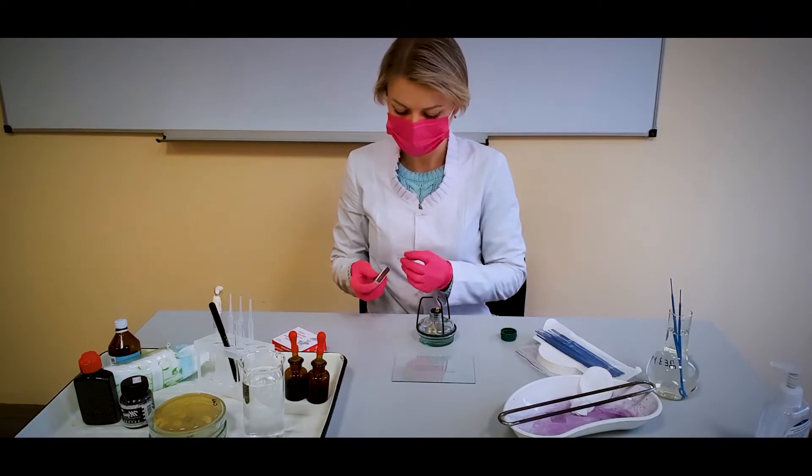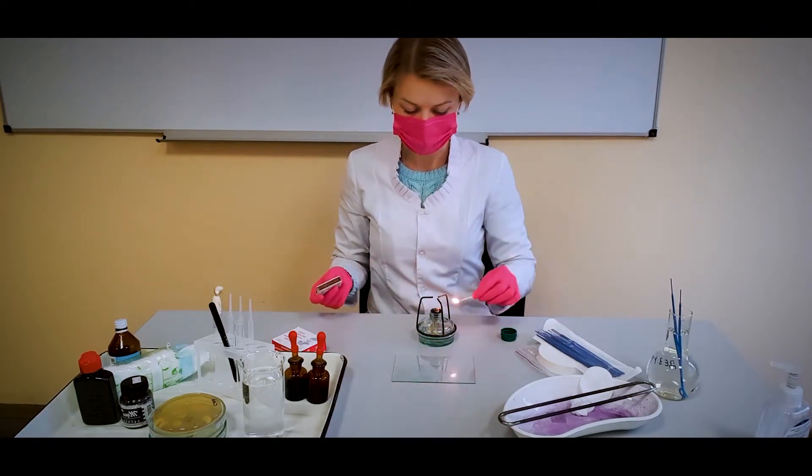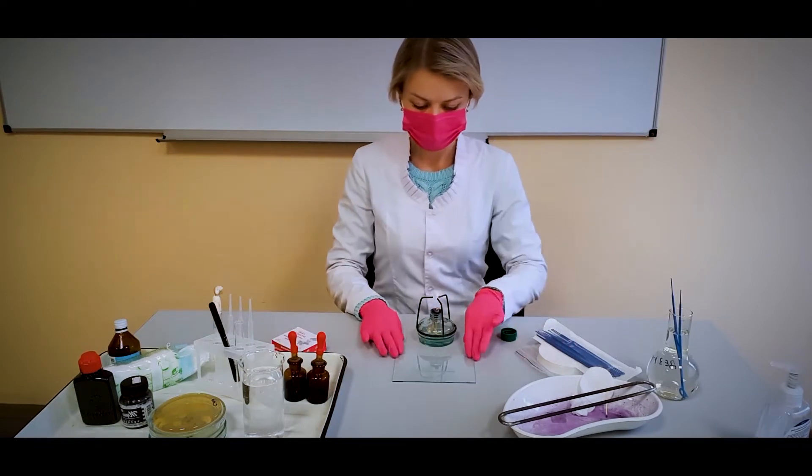That is, we use a stain which stains the background, against which the uncolored capsule can be seen.